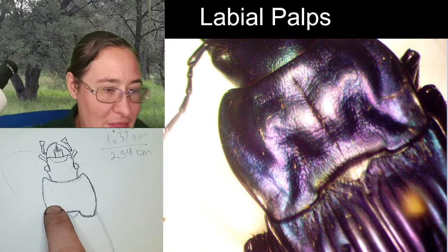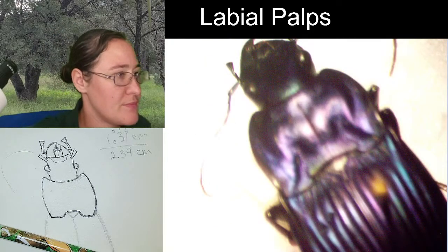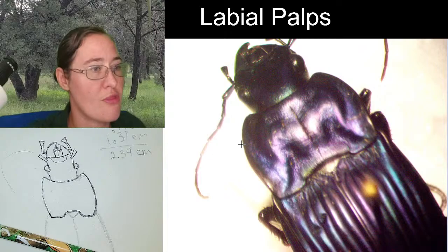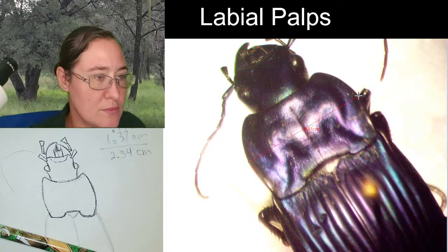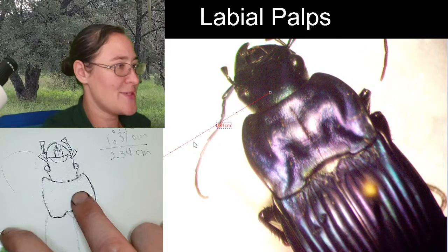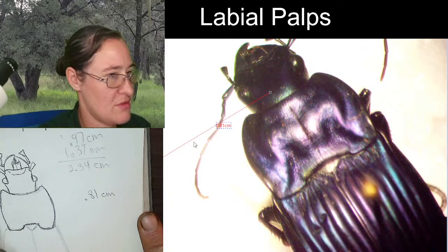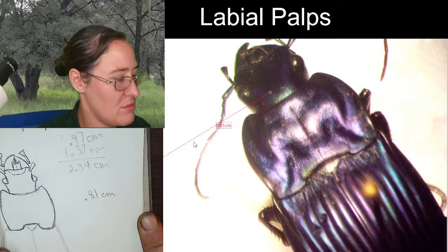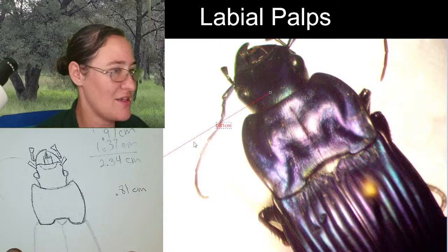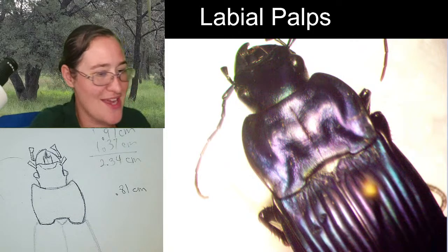How wide is it at the widest point of the pronotum? The widest point of the pronotum, it is 0.81 centimeters. Whoa! I think mine should be just a little bit wider, huh? Thank you for asking!